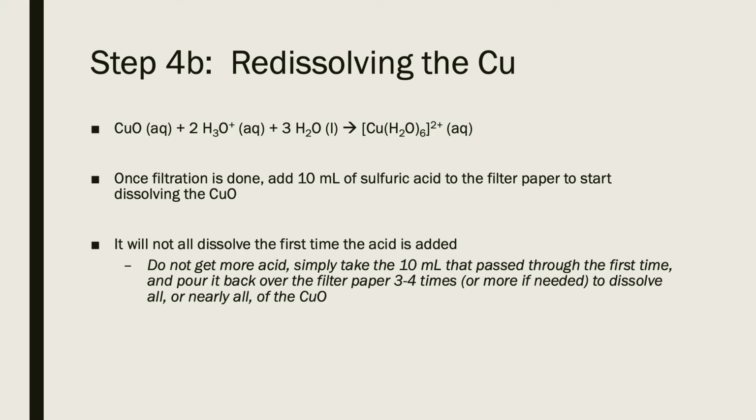It's not all going to dissolve right away, that's fine. But what you're going to do, instead of getting more acid, you're just going to keep reusing that same 10 milliliters and just pass it over the filter paper over and over, in repeated cycles.